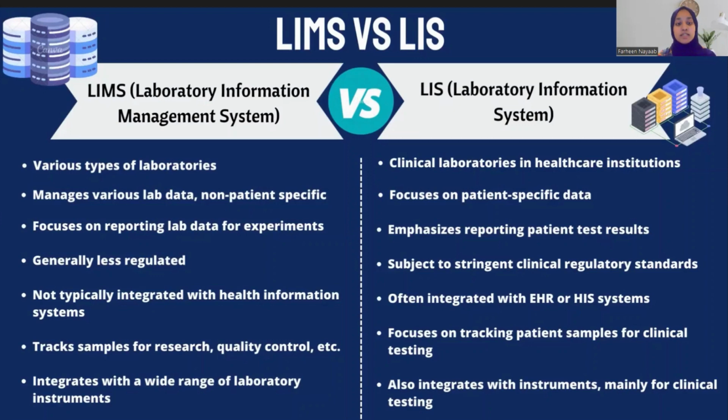LIMS, as it is not clinically specific, is generally less regulated. On the other hand, LIS is subject to stringent clinical regulatory standards as it deals with patient data, which is very sensitive. Next, LIMS is not typically integrated with health information systems as it is not clinical specific, while LIS is often integrated with EHR or HIS systems.